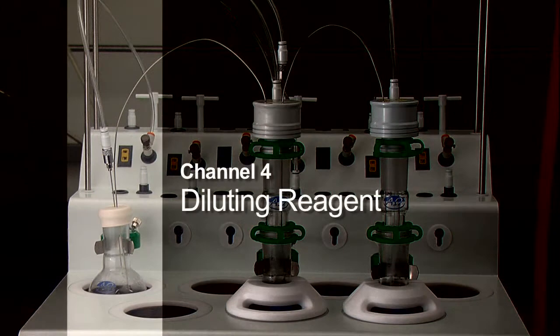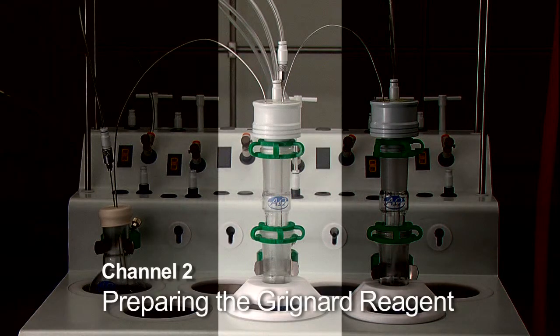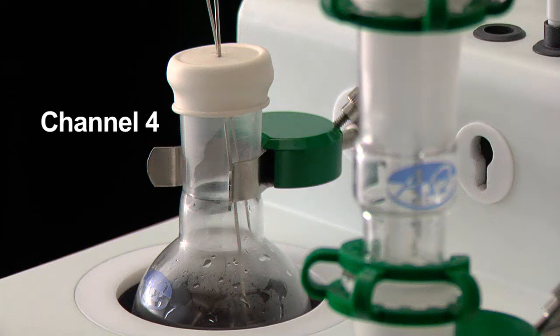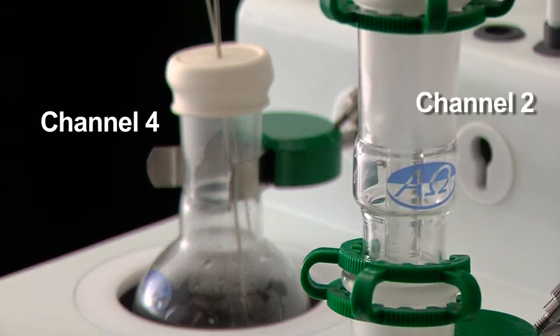First, we dilute phenyl bromide in channel 4. In channel 2, we prepare the Grignard reagent by heating the magnesium solution to 70 degrees and transferring the liquid in drops by inert gas from channel 4 to channel 2.